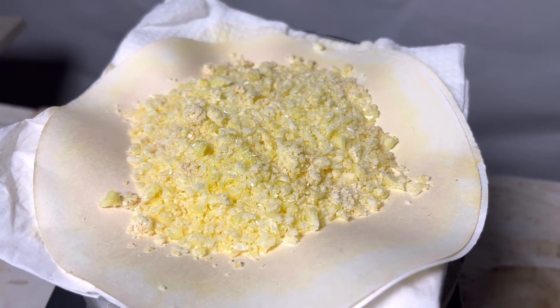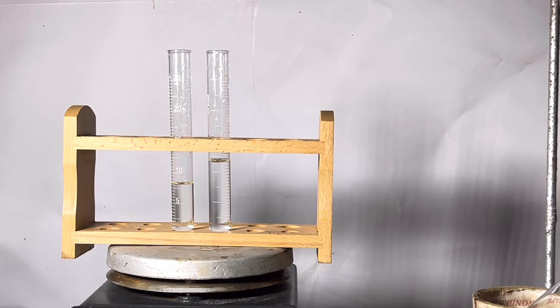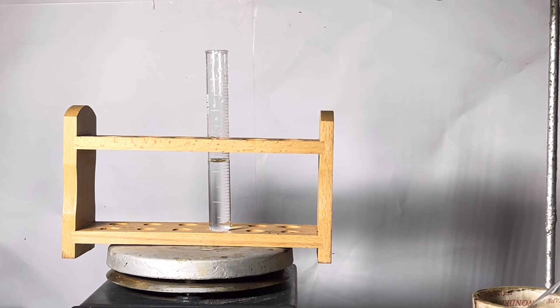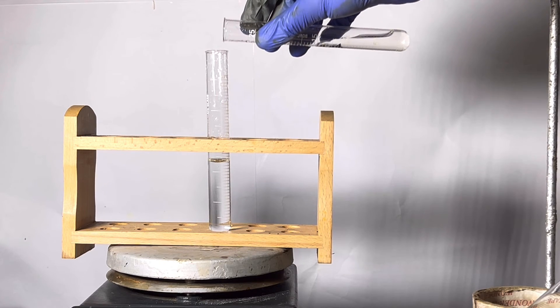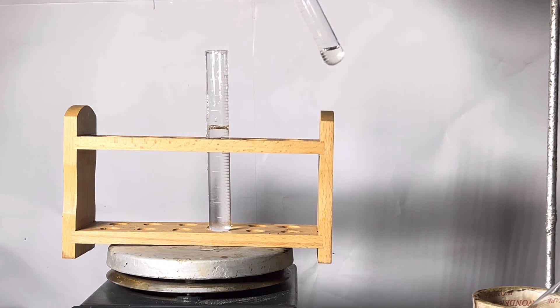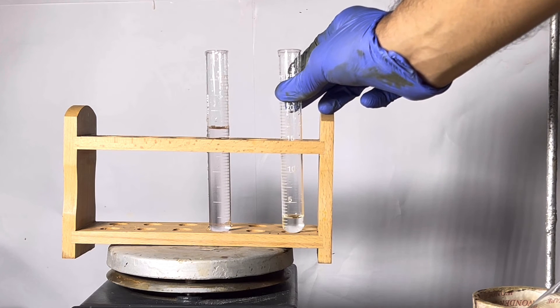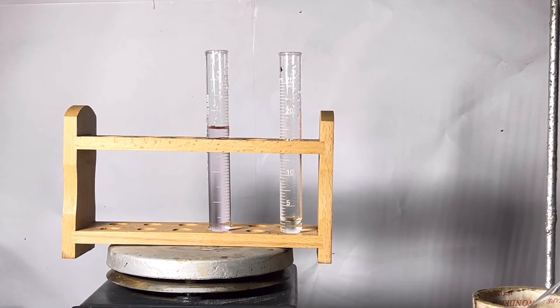We will do the basic test for confirming barbituric acid. To the left, I have sodium nitrite solution, and to the right, the presumed barbituric acid solution. The sodium nitrite solution was added to the barbituric acid solution. After a few seconds, we notice a color change to purple. This is sodium violurate being formed, confirming that the compound is indeed barbituric acid.